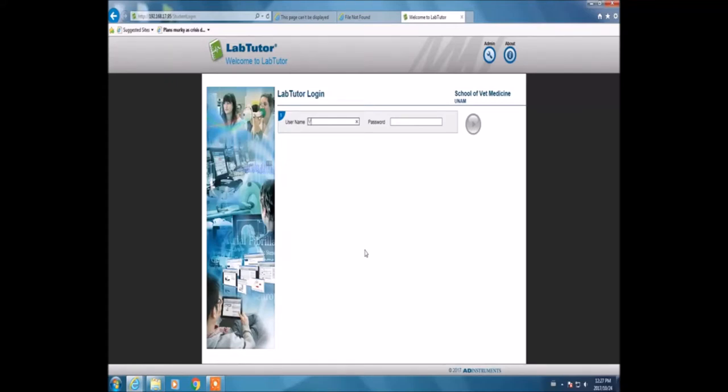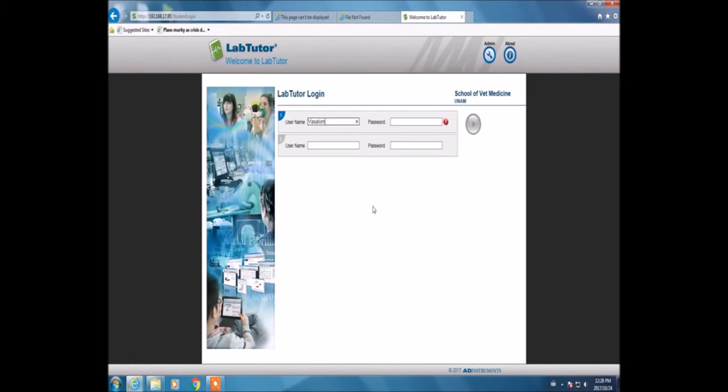Welcome to LabTutor. I'm logging in now. This is where I have to put my username and password. Then I'm going to log into the platform in order to perform the experiment.